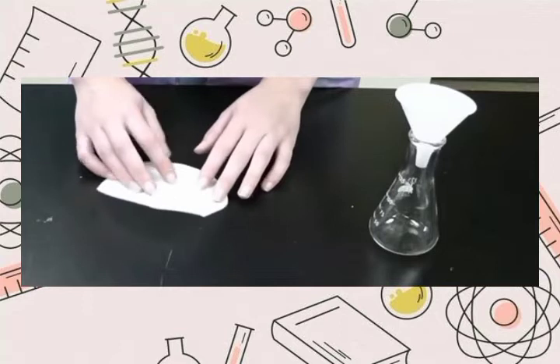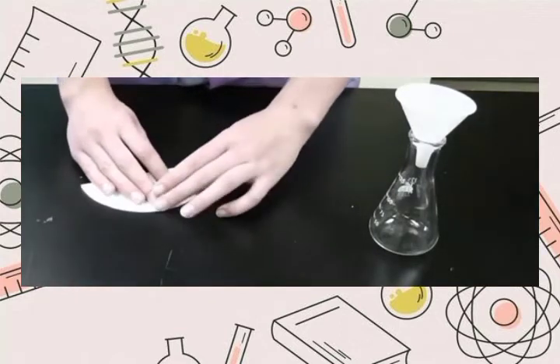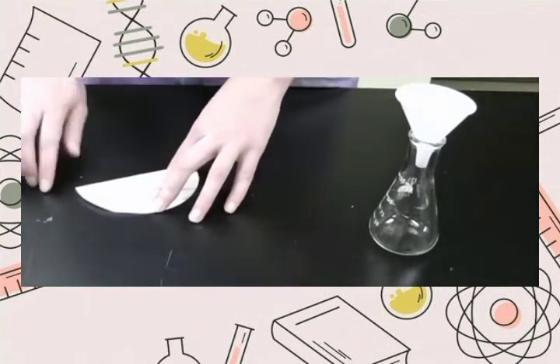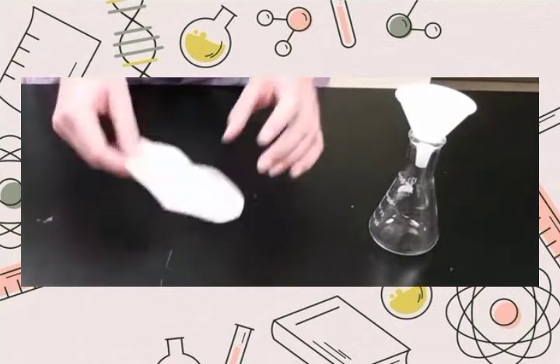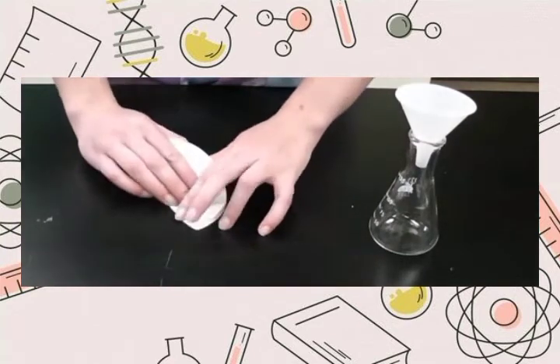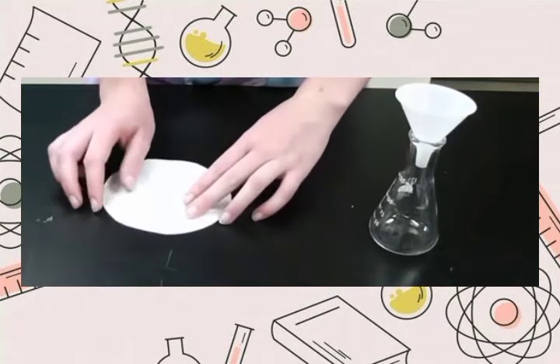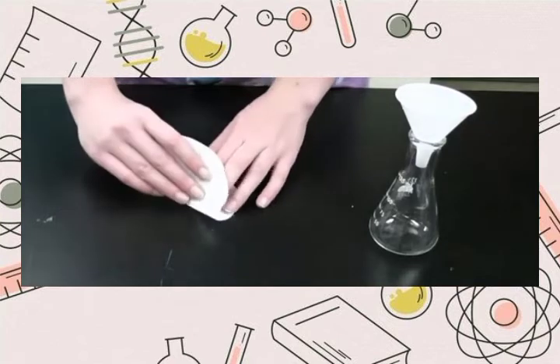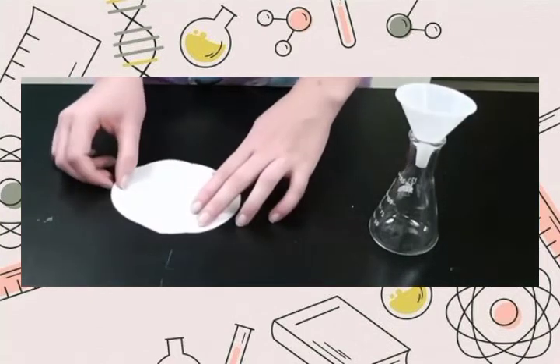Then flip it over on the bench and repeat what you just did, placing the folds midway between the folds made on the other side. When you're folding a filter paper, don't use a ruler or press too hard with your fingernail when folding. When you are done, your filter paper should be divided into 16 with alternating creases up and down as seen here.